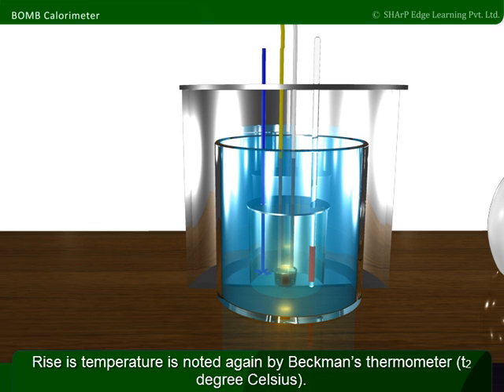The rise in temperature is noted again by Backman's thermometer, i.e., T2 degrees Celsius.